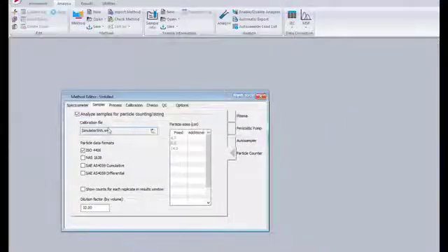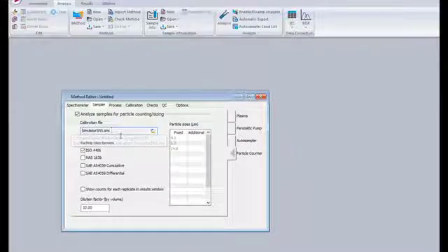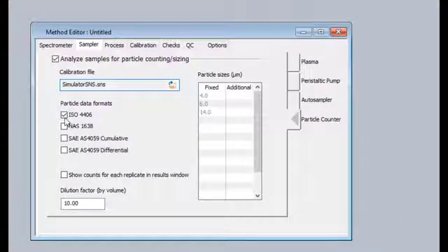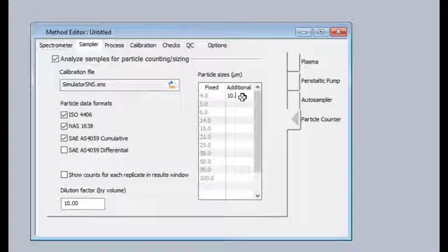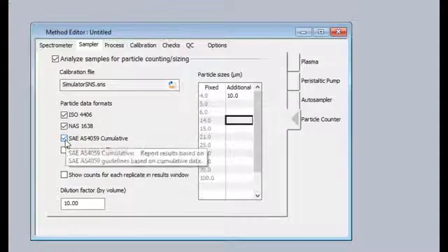This tab is also where the different particle sizes can be selected by choosing one or more of the standard formats. Some fixed sizes appear, but more can be entered by the user in the additional column. Selecting any of the formats provided also dictates what is shown in the results window and what classifications are available for when the results are exported.